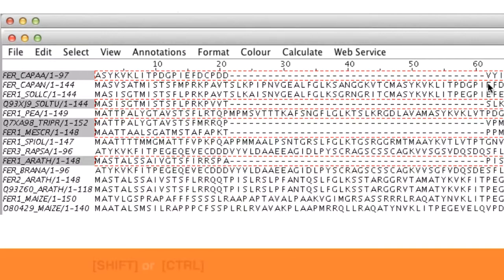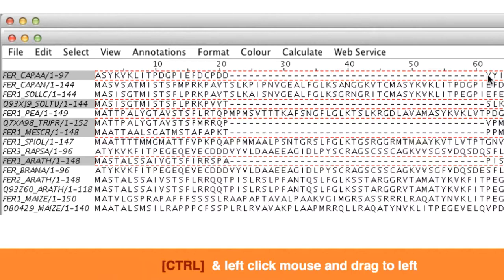Gaps can be removed by holding down the shift key for a single sequence or CTRL for a group of sequences and then dragging the residues to the left.